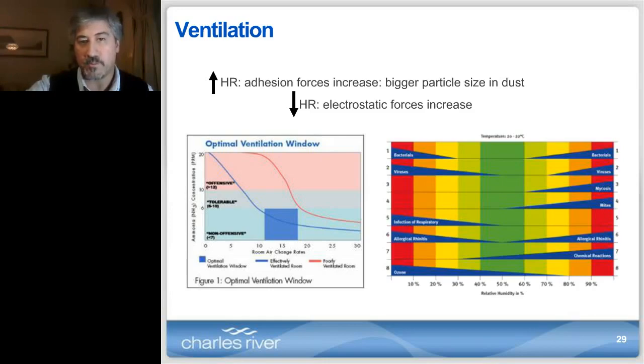While for poorly designed ventilation, we will need to go to 18, 20. But in order to guarantee that the environment is right, we pick those 20 air changes per hour. Pretty much the same thing applies to that comfort zone for relative humidity.